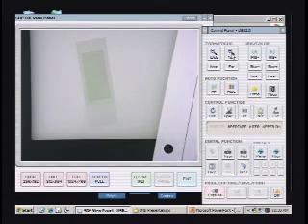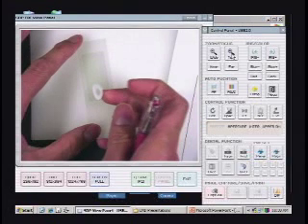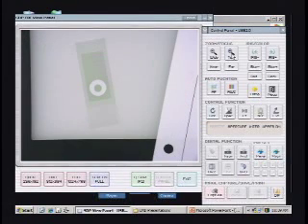You can actually stick those on, and you would of course do all this with gloves because these samples, remember, are going to go for DNA analysis. You want to stick those on there. Hopefully you can get 3 on there, if you get them all in there. And I like to put 3 circles on there and do 3 microliter spots.